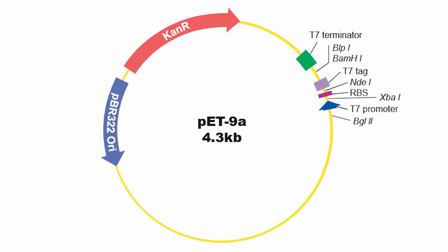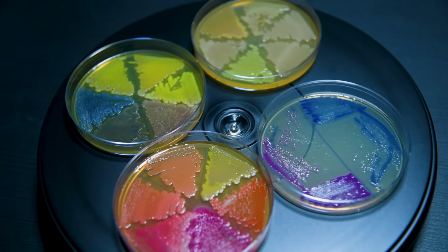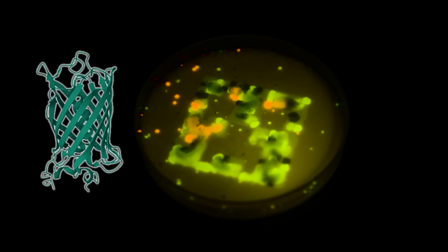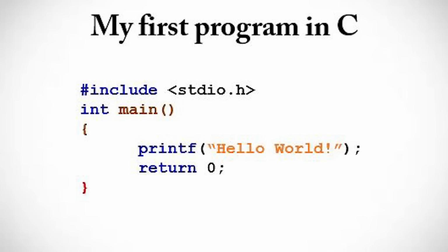So, with the basics sorted, what can we actually put in here? Well, let's start off easy. One of my favorite families of proteins are the fluorescent proteins. As their name implies, they're proteins that respond to UV light by glowing brightly, and they come in literally every color. They're also the closest thing to a Hello World equivalent that you're going to get with DNA, so are the perfect thing to start with.